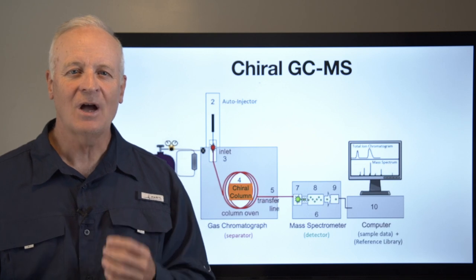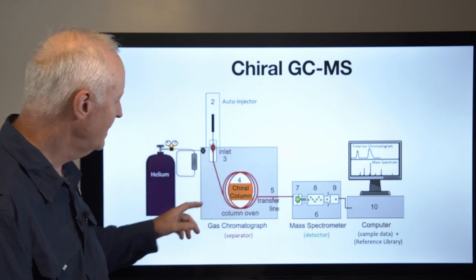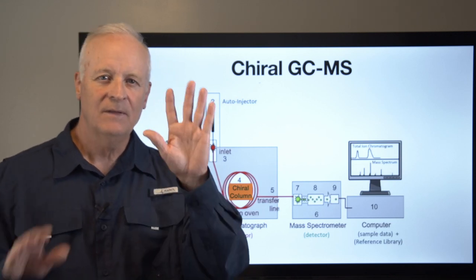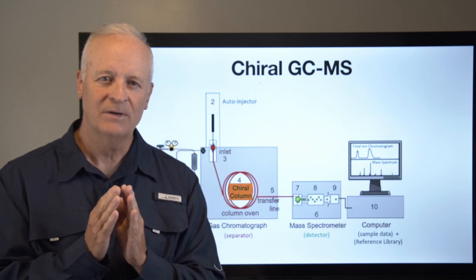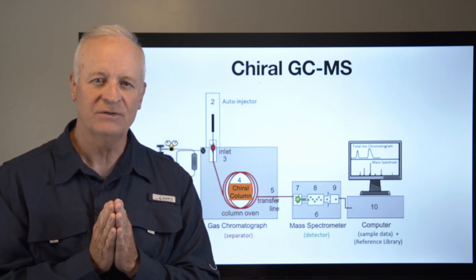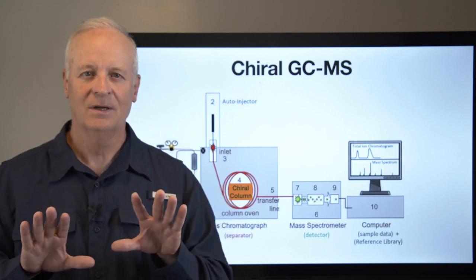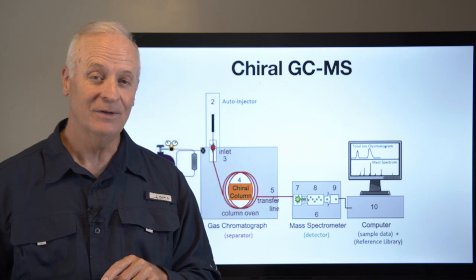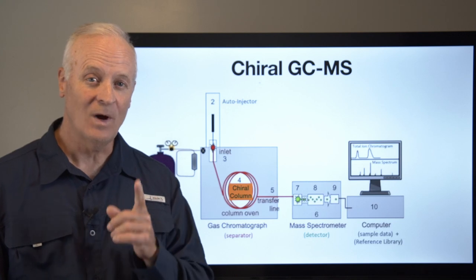So I had to use chiral GCMS. And the only thing that's different in GCMS is this chiral column that can distinguish between these left and right-hand molecules. So in normal GCMS, these two molecules come out together as one component. But in chiral GCMS, the chiral column here will separate left and right-handed molecules. And by looking at the left and right-handed molecules, we see the difference in Oman and Somalia frankincense and why they smell different too.